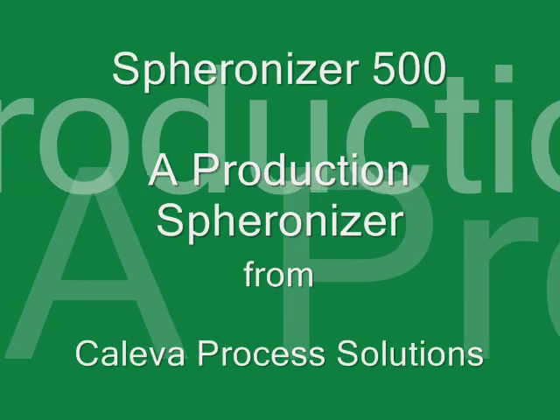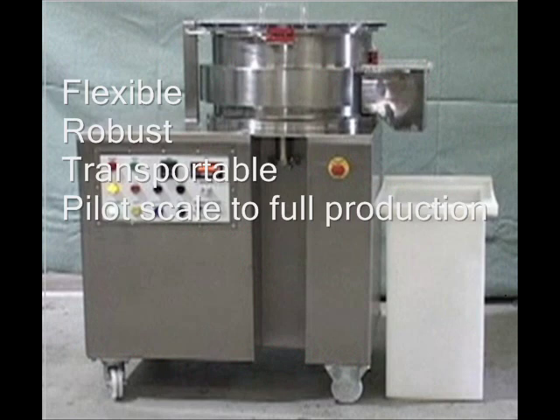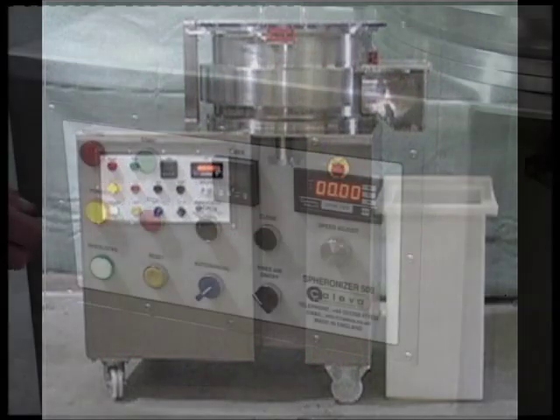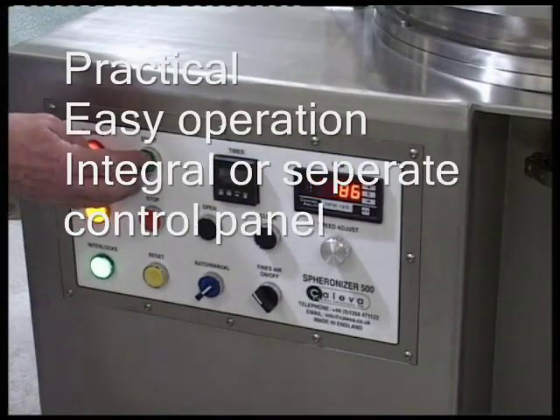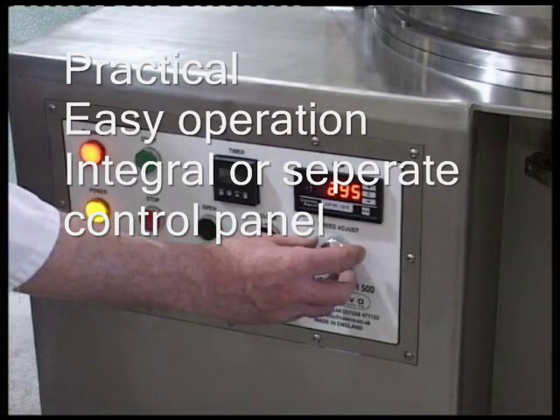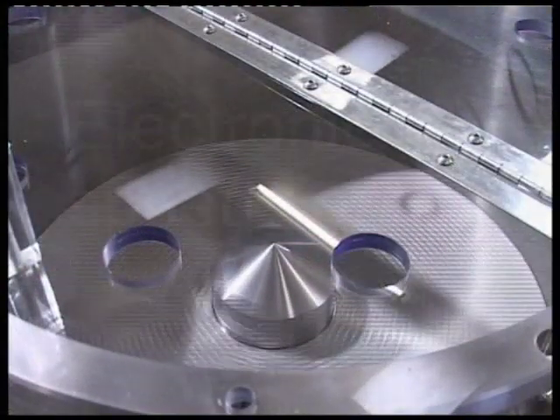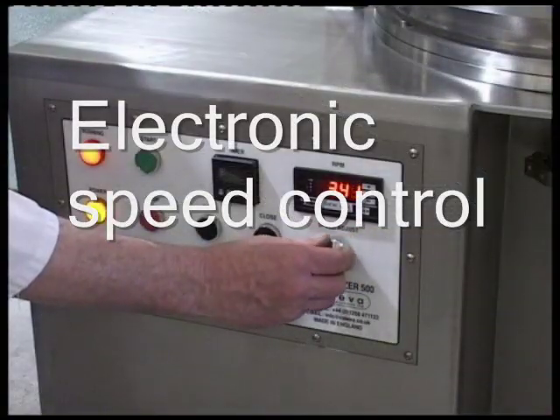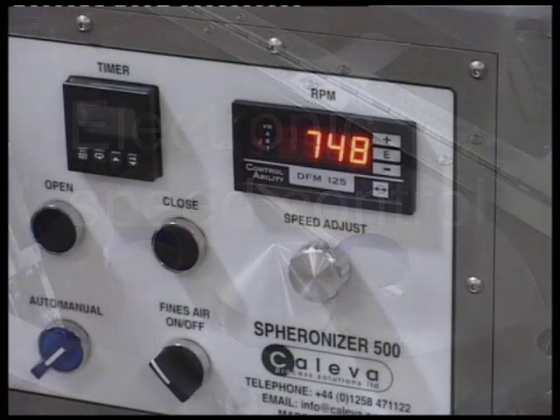The Spheronizer 500, a flexible, robust and transportable machine designed for pilot to full-scale production, with a practical and easily operated control panel that can be either in the body of the machine or mounted on a pendant arm according to user requirements. The electronic speed control is managed by a 10-turn potentiometer with digital speed display in revolutions per minute.